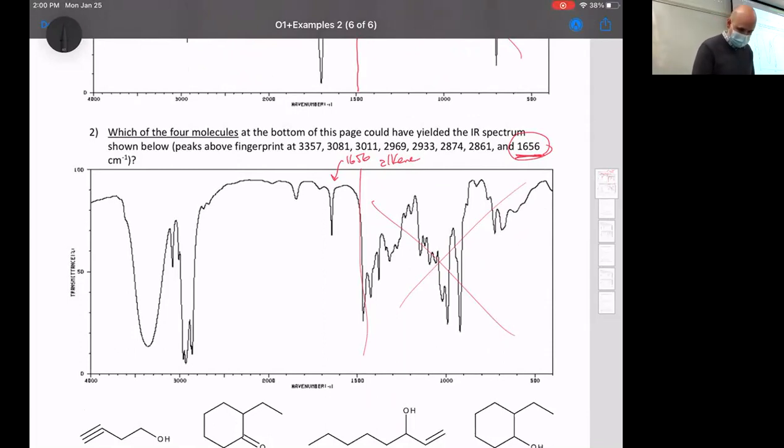All right, let's keep going. What about all of these things right here? Yeah, you get to do this whole one. You're welcome. It's because you're my favorite student. Don't tell anyone. All right, so all these 2,800 to 3,000 peaks are, yeah, okay. So congratulations, you got it. Okay.